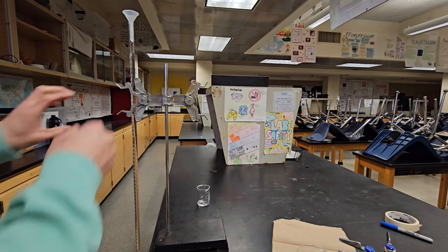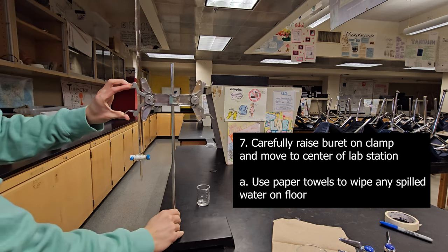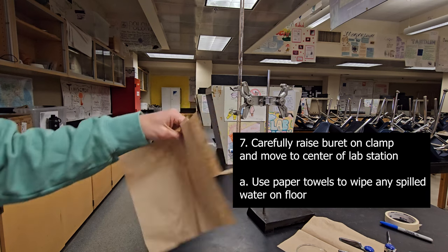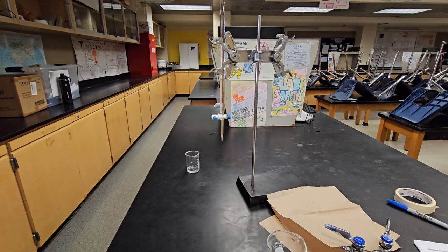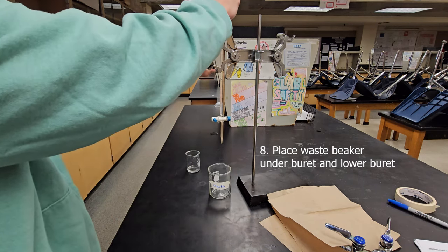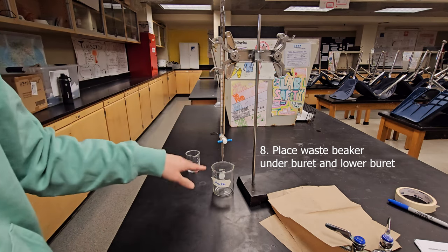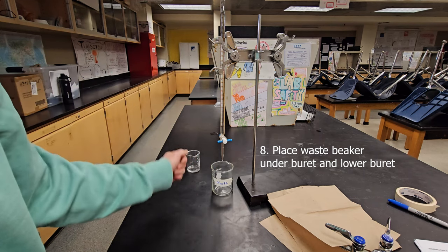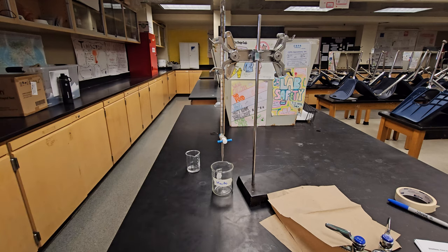Now that you're done filling, raise the burette — making sure the tip does not touch anything — and slowly and carefully move it back to the center of the table. Pick up your paper towels; since the burette was closed, it should be completely dry, so set them aside for cleanup. Then get your waste beaker and place it underneath the burette. Lower the burette slightly so the water doesn't have far to fall, but make sure the tip is not touching the waste beaker — it should remain above it without direct contact.